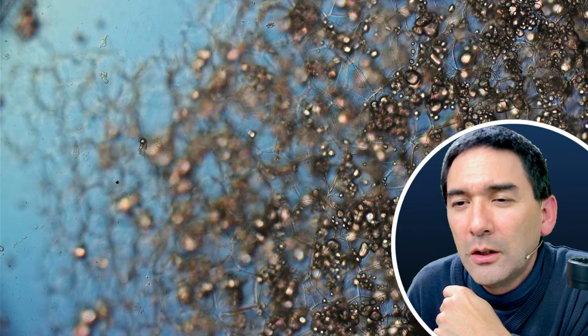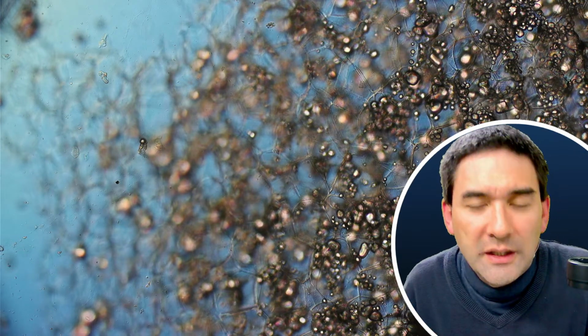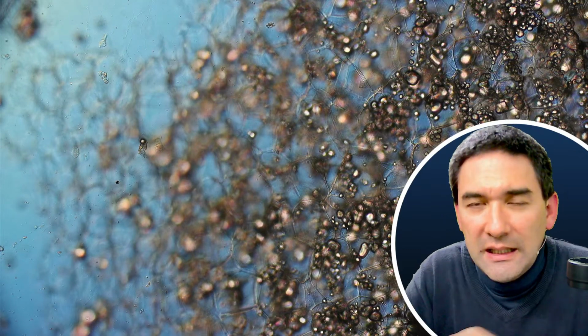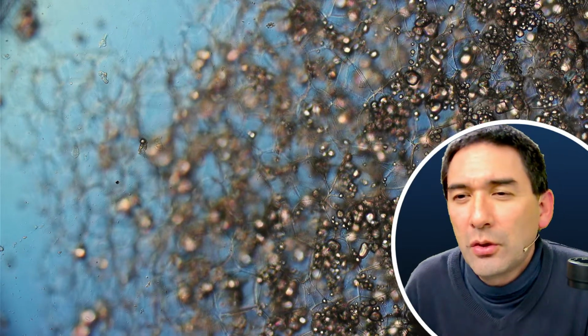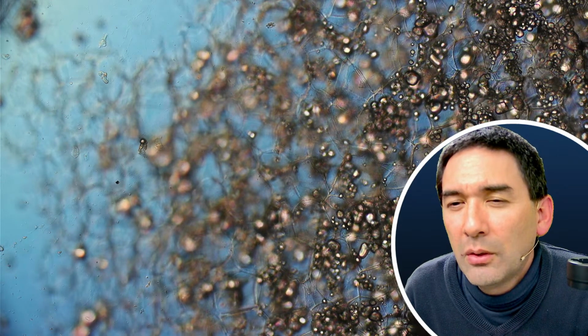Oliver, what if you dilute the iodine with 5 parts of water? Yes, you can do that, and that's what I'm also doing occasionally. I dilute it down, and then I rinse everything again in water before I put it under the microscope. Can you embed a small sample of something in potato or carrot and slice it?